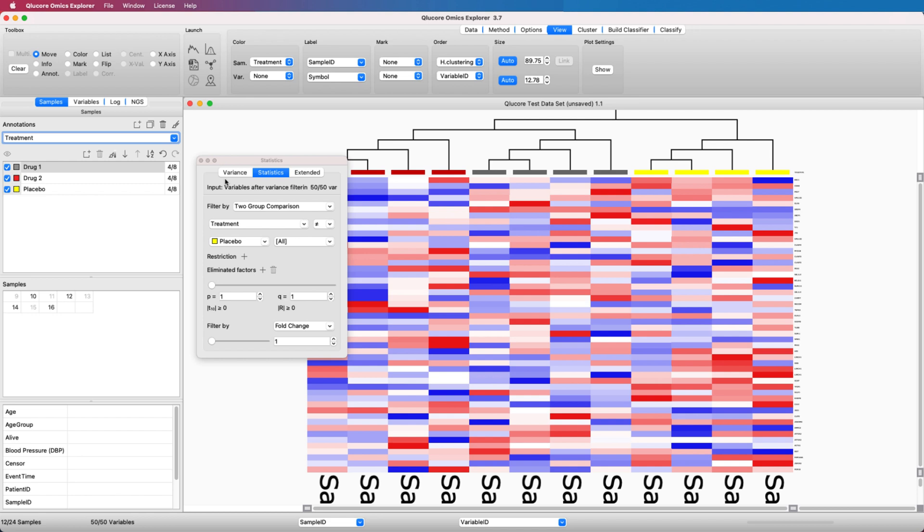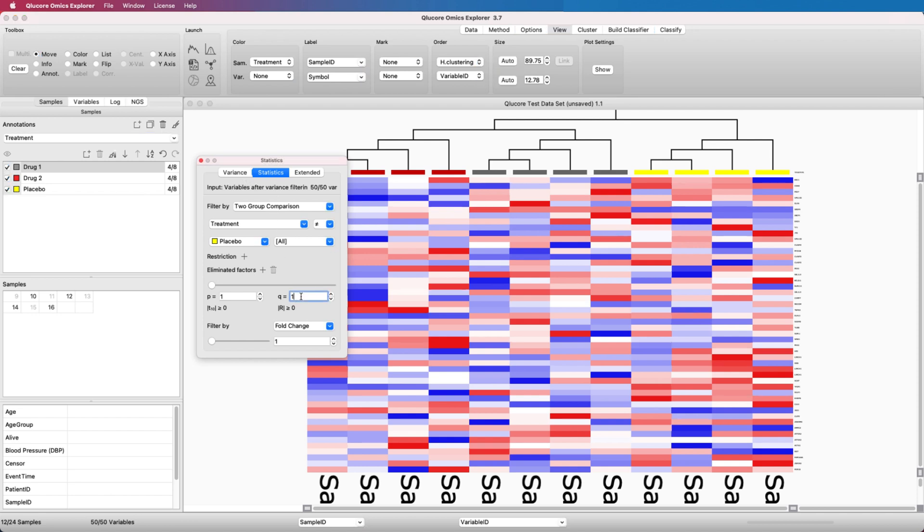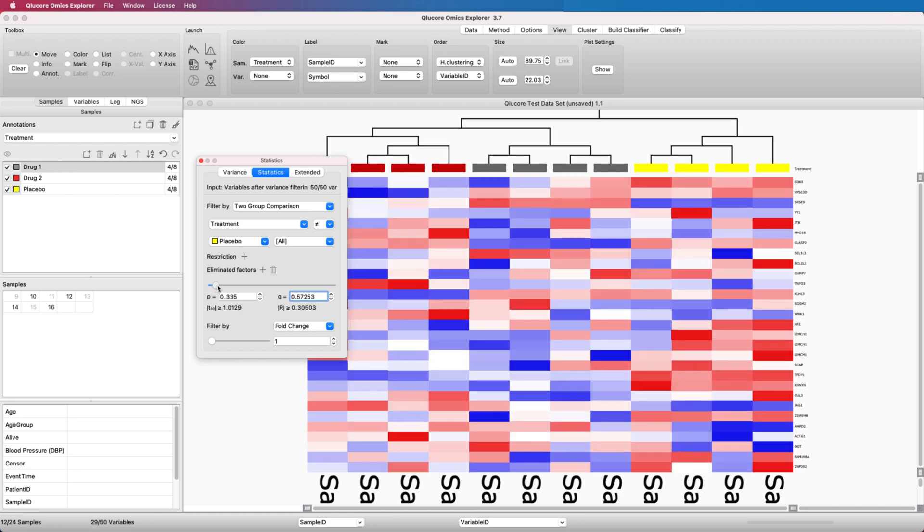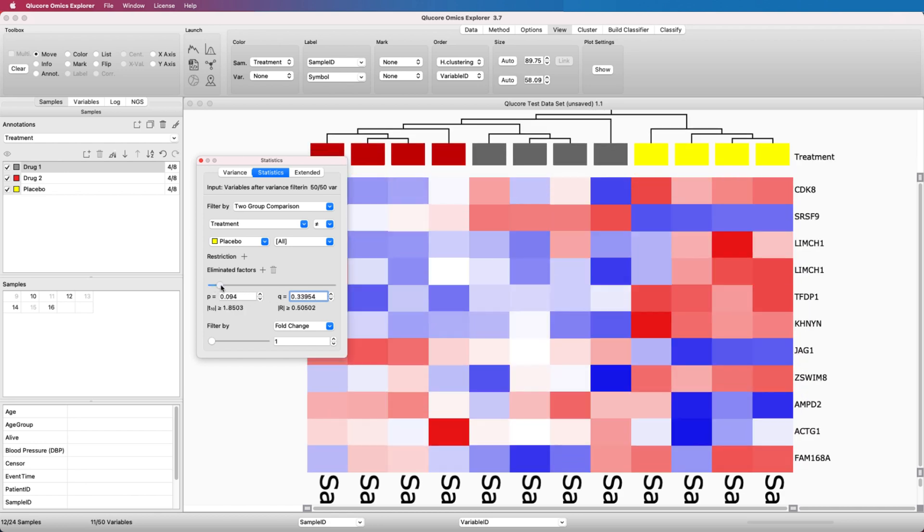There are two ways to determine how many variables should be kept after using the statistical filtering. Either you enter a cutoff value, preferable in the QValue box—QValue is also known as False Discovery Rate—or use the slider to interactively select the number of variables to get.